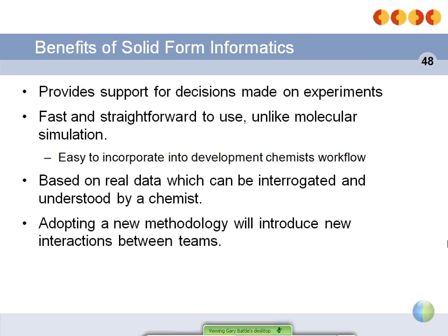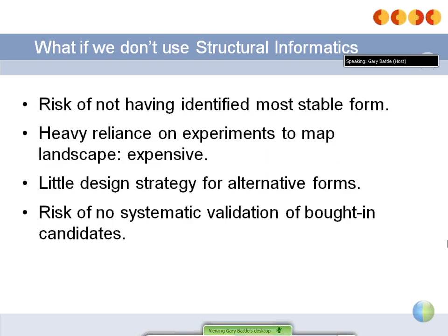Of course, we could continue to work as we have done, but that does leave us with the risk of late appearing polymorphs, and also means we may fail to spot the solid form opportunities that lie in front of us.